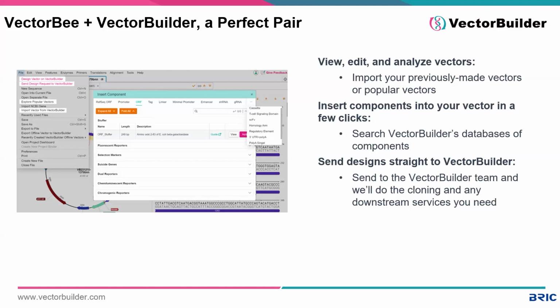So I wanted to hit these highlights about how VectorBuilder pairs with VectorBee, but there's no better way than to actually show everyone how we can get into VectorBee and utilize all that it has to offer.